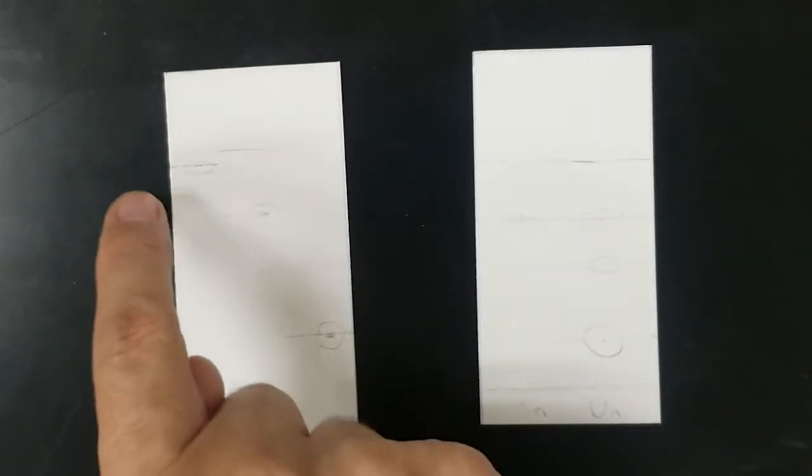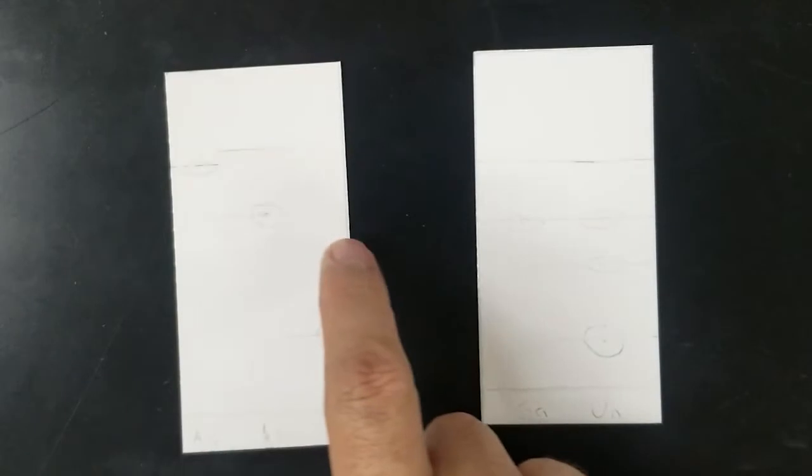Okay, we're now ready to gather our measurements to calculate the RF. Remember, you need how far the compound went divided by how far the solvent went. So it's the ratio front, the RF value we're calculating here. What I did here was I drew lines across for each one of these where all the spots were. I don't normally do this, but I did it for the sake of the video so you guys can get your measurements.